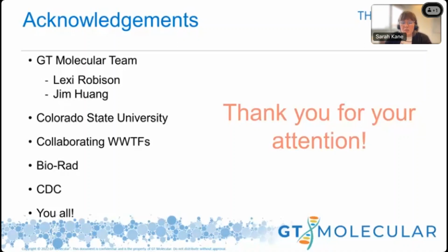Okay, and then David was wondering what concentration methods and kits do we use for collection and extracting of viral and bacterial targets? And that is a wonderful question, and it's very nuanced. So we've seen that a lot of folks use the Ceres nanotrap particles, and we collaborate with Ceres all the time to make sure that our digital PCR kits are compatible with the concentration methods that they have.